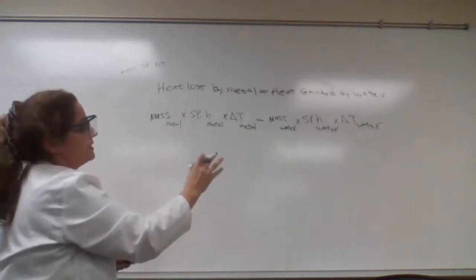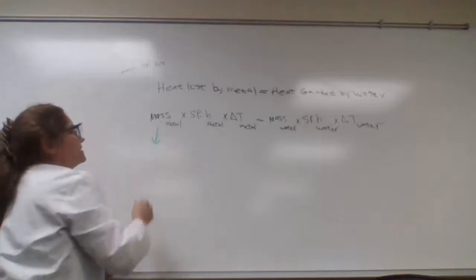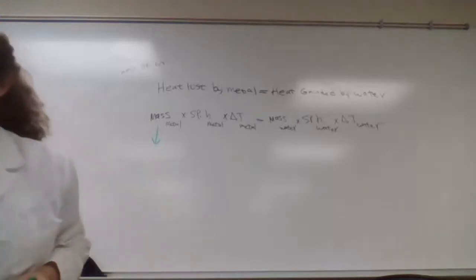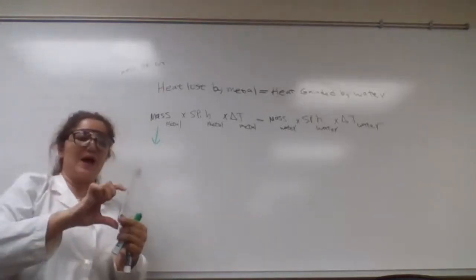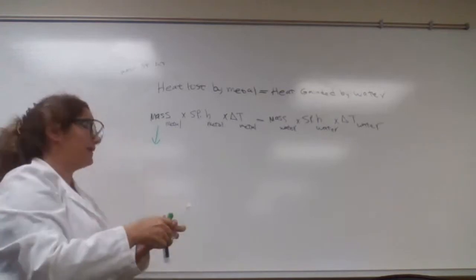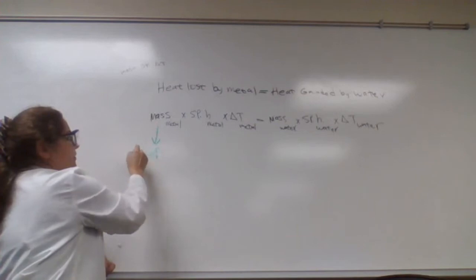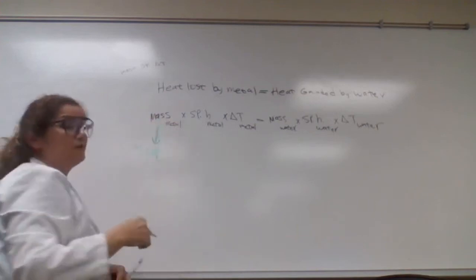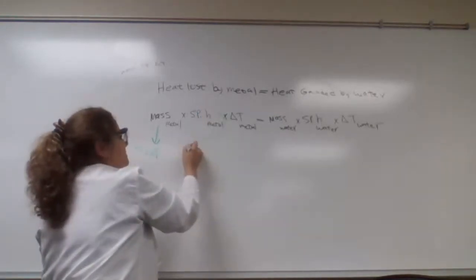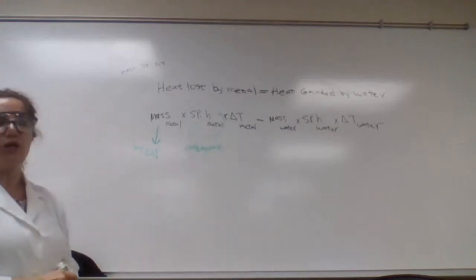It's an equation, and when we perform the experiment, this value is going to be measured, right? How do we measure that? It's the mass of the test tube. First, you measure the mass of the test tube. You add the metal to the test tube. You measure again. Then by subtraction, you get the mass of the metal. So we find this by experiment. When we follow the procedure, we are going to find this value. The specific heat for metal is unknown for this experiment. For part A of the experiment, the specific heat of the metal is unknown.